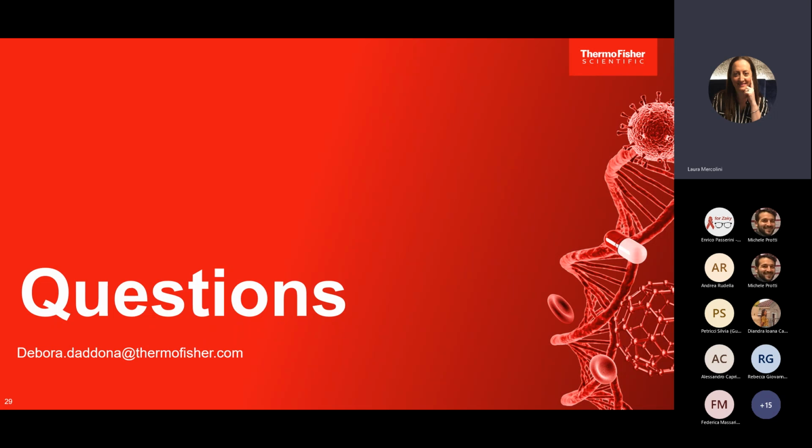On the same sample. So it depends on the workflow. Obviously, the workflow setup now is meant to find fluorine components. So you can really get very precise results if you are searching and screening for fluorine-containing components. If you change the workflow a little bit, easily because it's a drag and drop software, you can get even more results on your sample. So the reproducibility, if you work in the same workflow, will get you the same results.